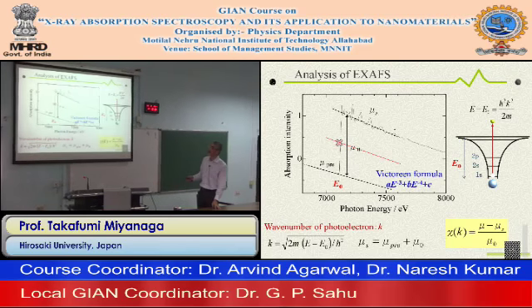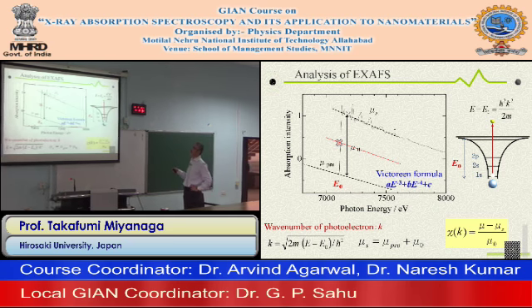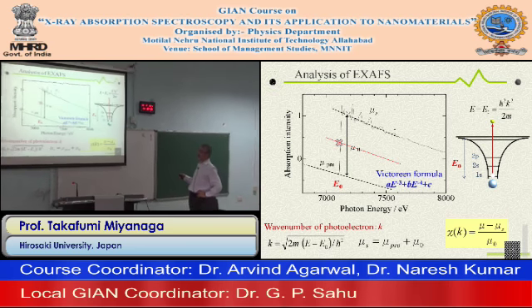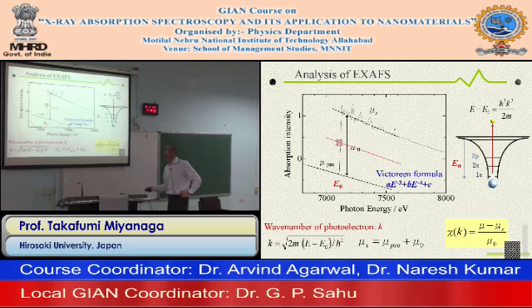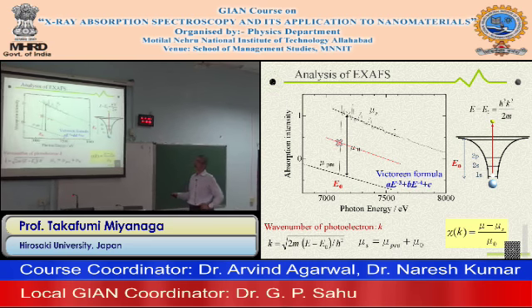This part is a general X-ray spectrum. This is simple, for example, iron ions. The electron energy is determined for these free electrons, so the wave number of electrons can be exchanged to these equations. The E0 should be the edge energies. This background spectrum is expressed by the Victoreen formula we discussed yesterday.